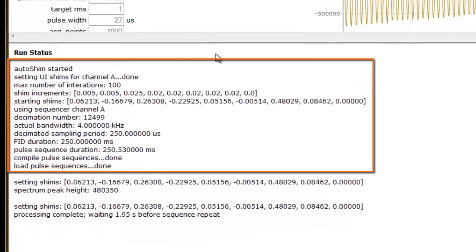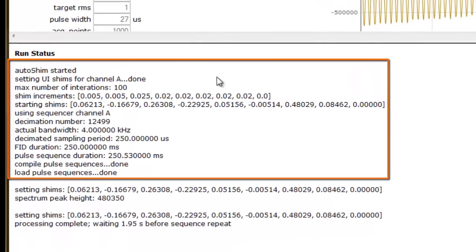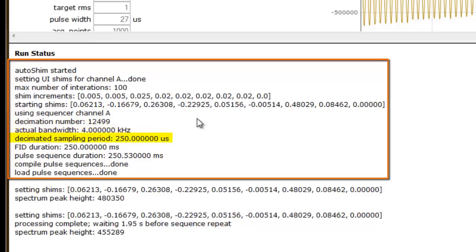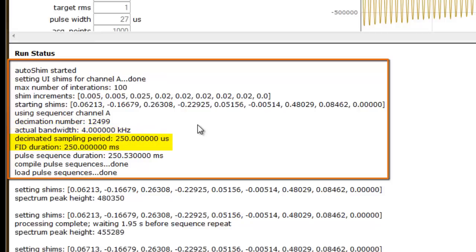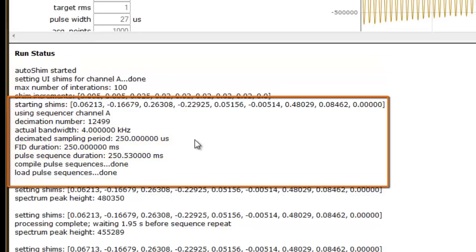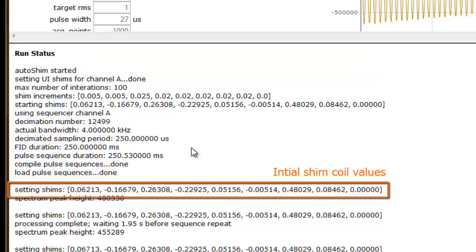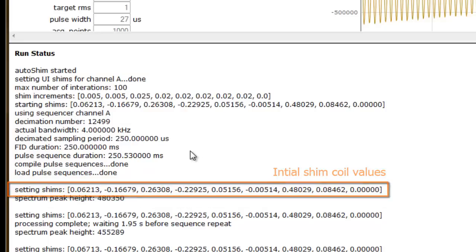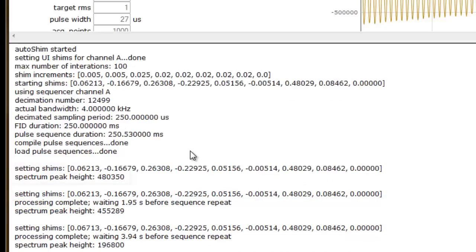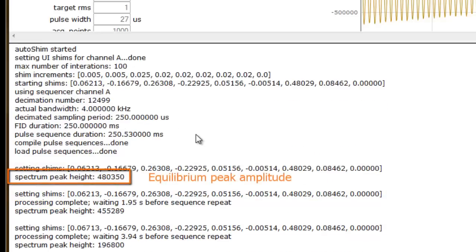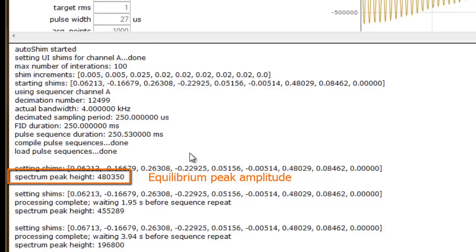First we see a series of initialization parameters, such as bandwidth and signal decimation, sample period and FID duration, and pulse sequence duration. The pair of lines just below these data fields displays the initial coil values which the AutoSIM script will adjust. The relaxed, or equilibrium, spectrum peak height appears on the second line. This value is discarded from evaluation.